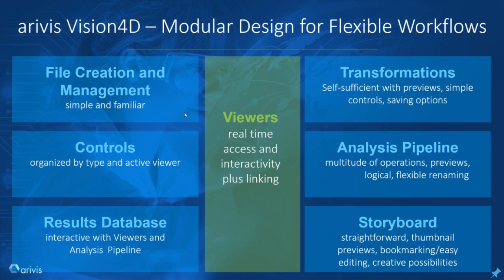And I think that this is, at least for me, the most important thing when it comes to image analysis. I need to be able to move through the images and move through different operations to figure out what the answer is going to be, because it's just not always obvious from the raw data how you're going to get to the final answer.